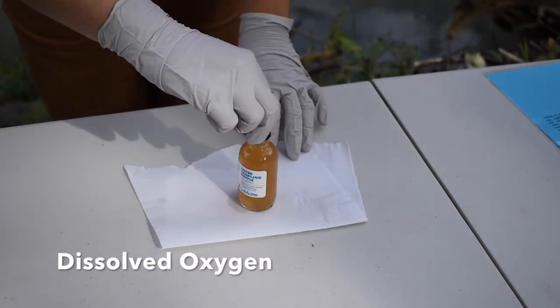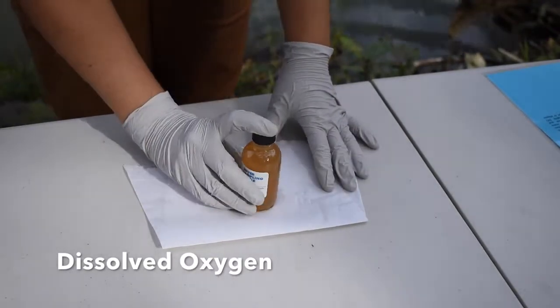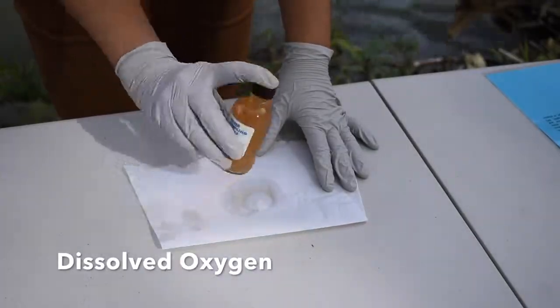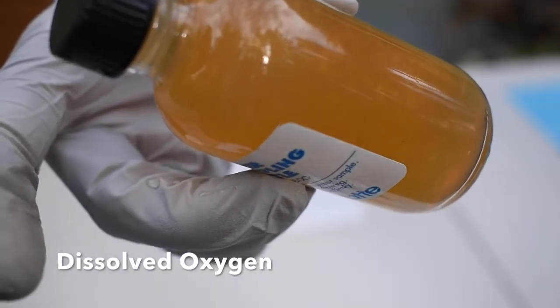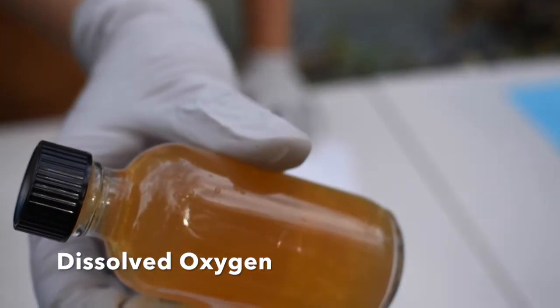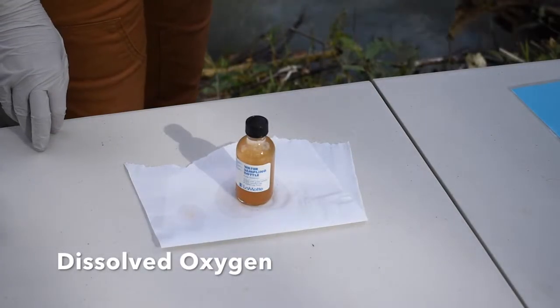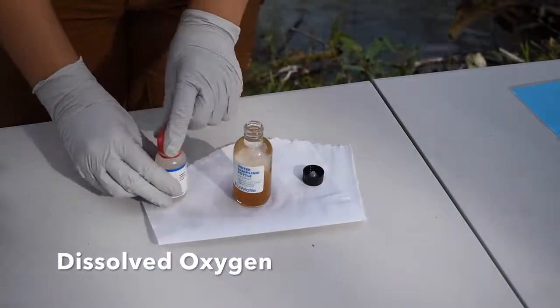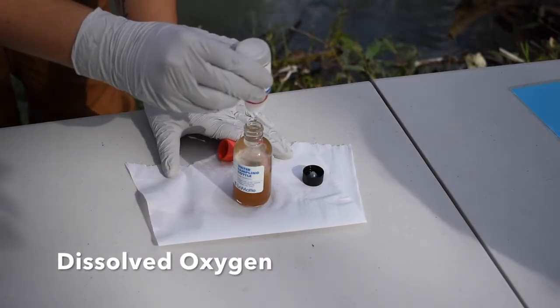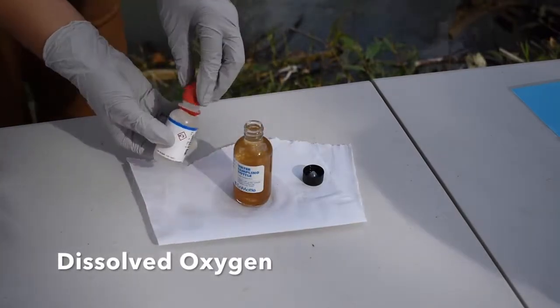Then, we will close the bottle and invert it to mix the contents. You can see a cloudy solid has formed in the bottle, also called a precipitate. After allowing the precipitate to settle below the neck of the bottle, we will open the sample bottle and add 8 drops of chemical number 3, sulfuric acid.